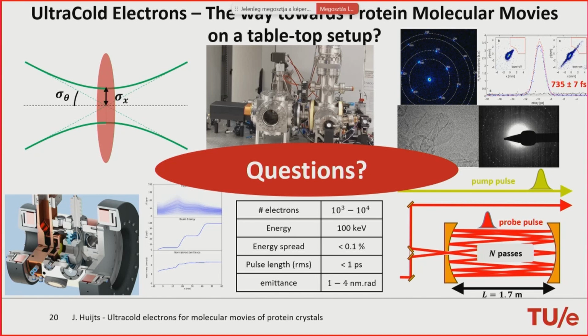So it depends a lot on how large you can grow the crystals. But in principle, if you compare electrons with X-rays, then per useful count on your detector, the numbers differ a bit, but there's between 2 or 3 orders of magnitude less radiation damage if you use electrons as opposed to X-rays.